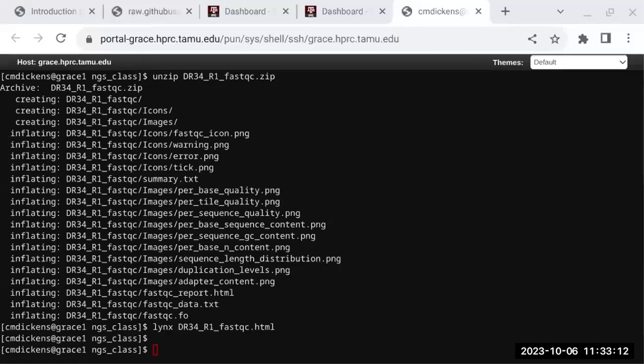You expect it to look like this first part here all the way across, but then towards the end, it just looks really bad. So what this is, is adapter enrichment towards the end. If I were to look at the quality scores, it starts out really good and then it just goes down to the red. So it's the opposite of this here.